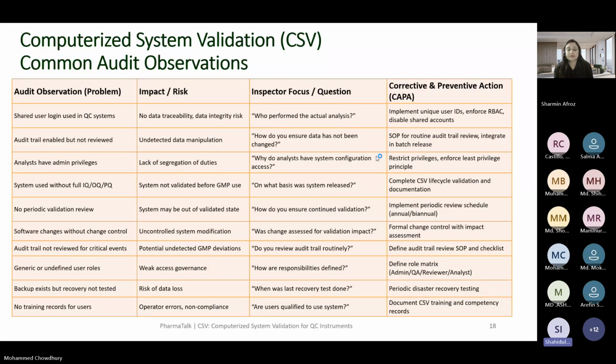Our IT has admin privilege, and they give us the authority that only this person can create recipes as a designee of IT. Is this person from the user department, maybe from QA? Is it acceptable?